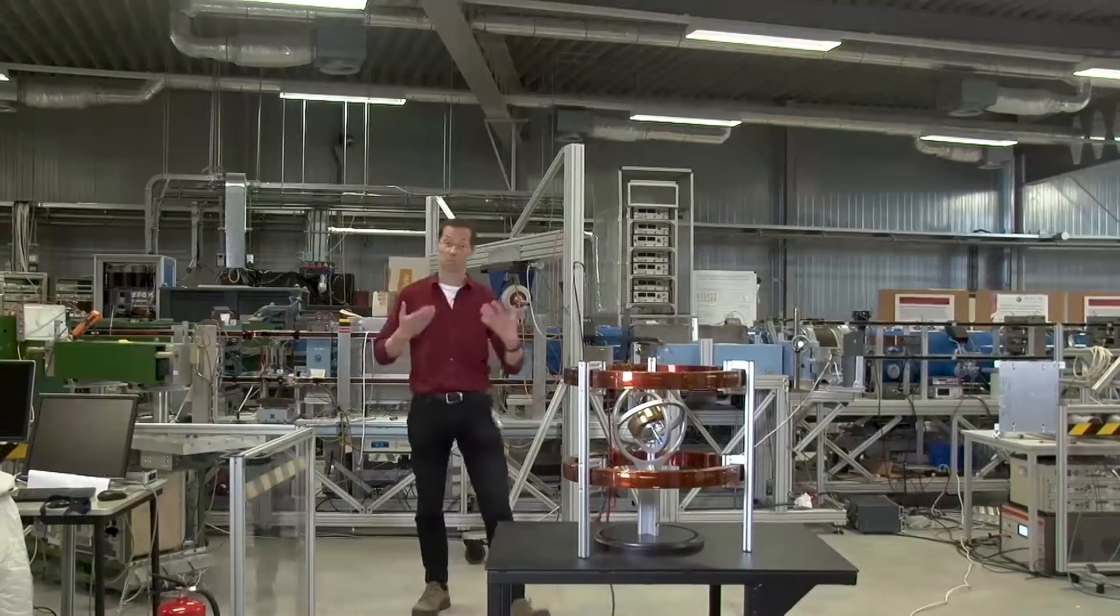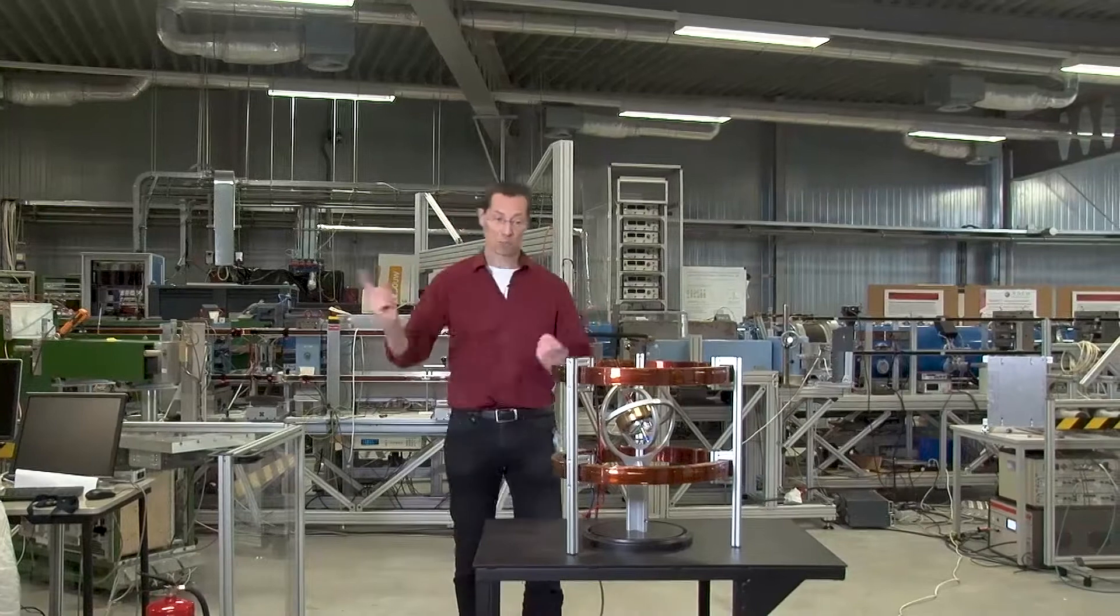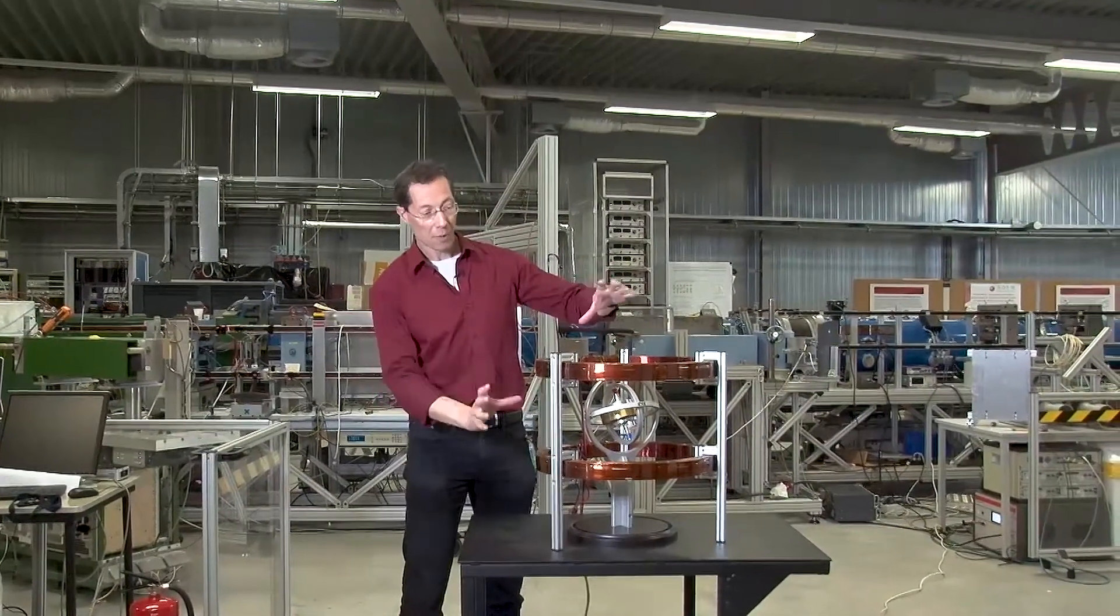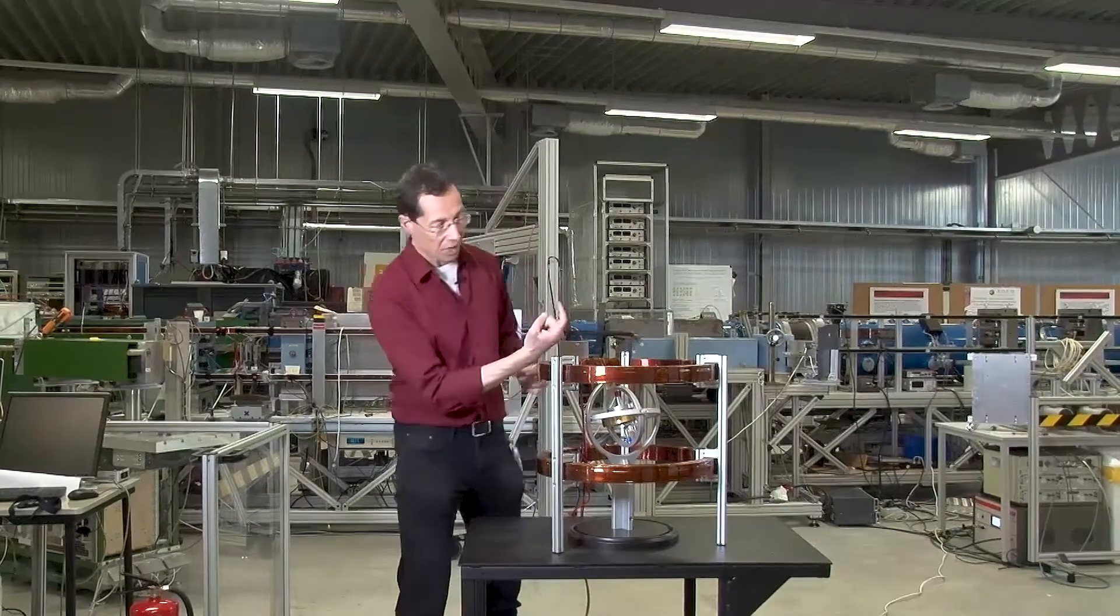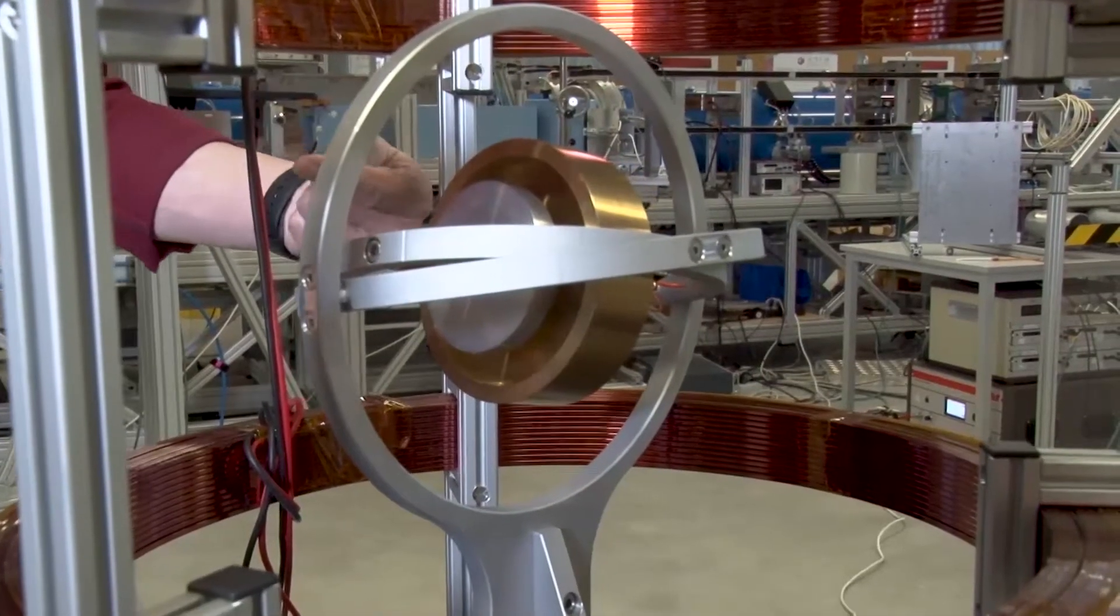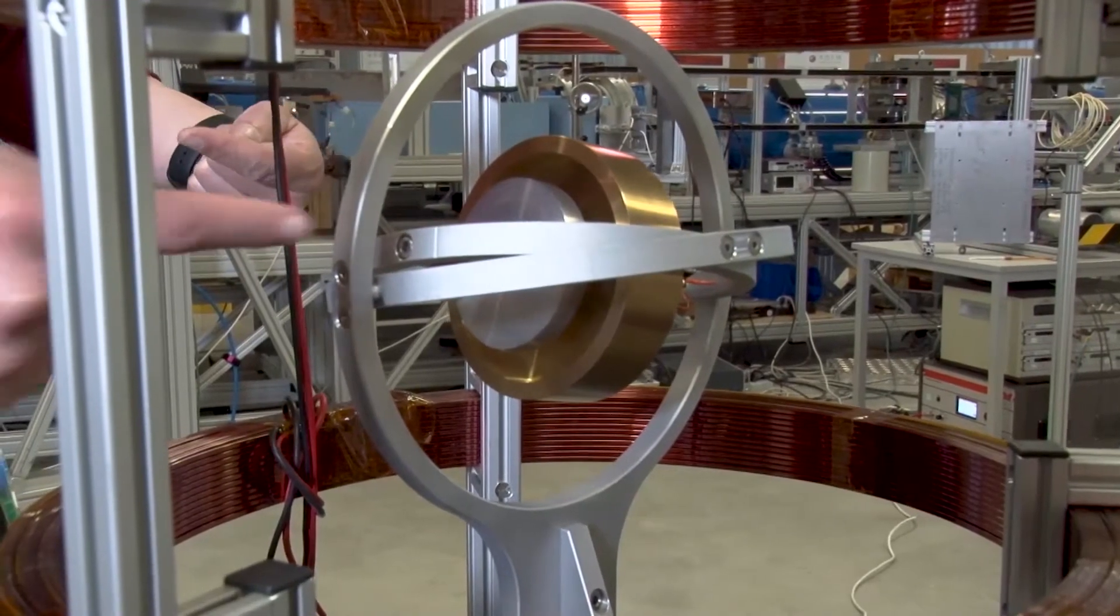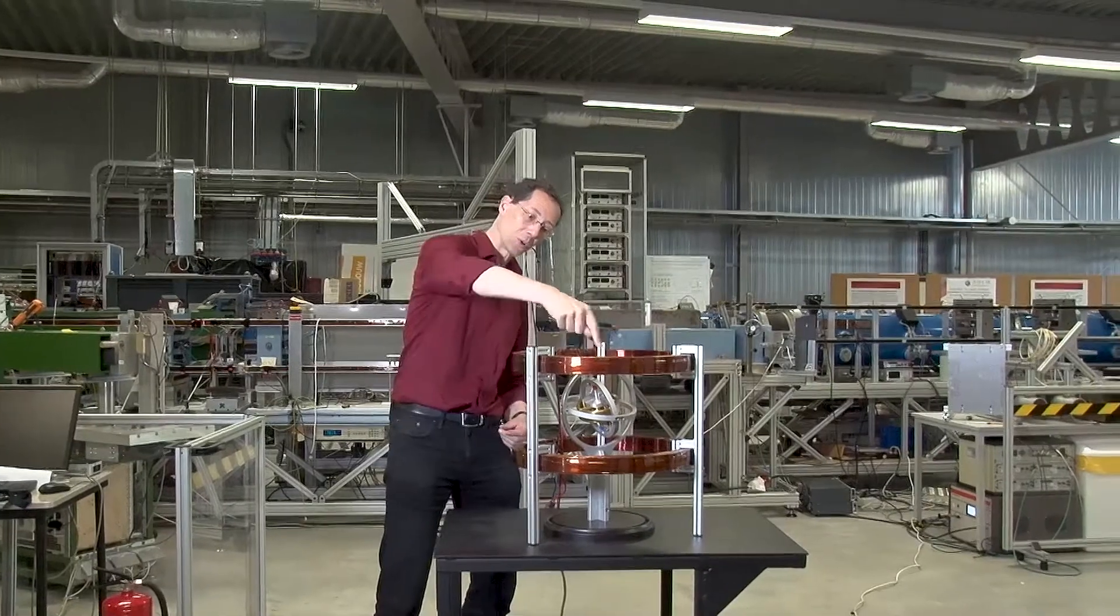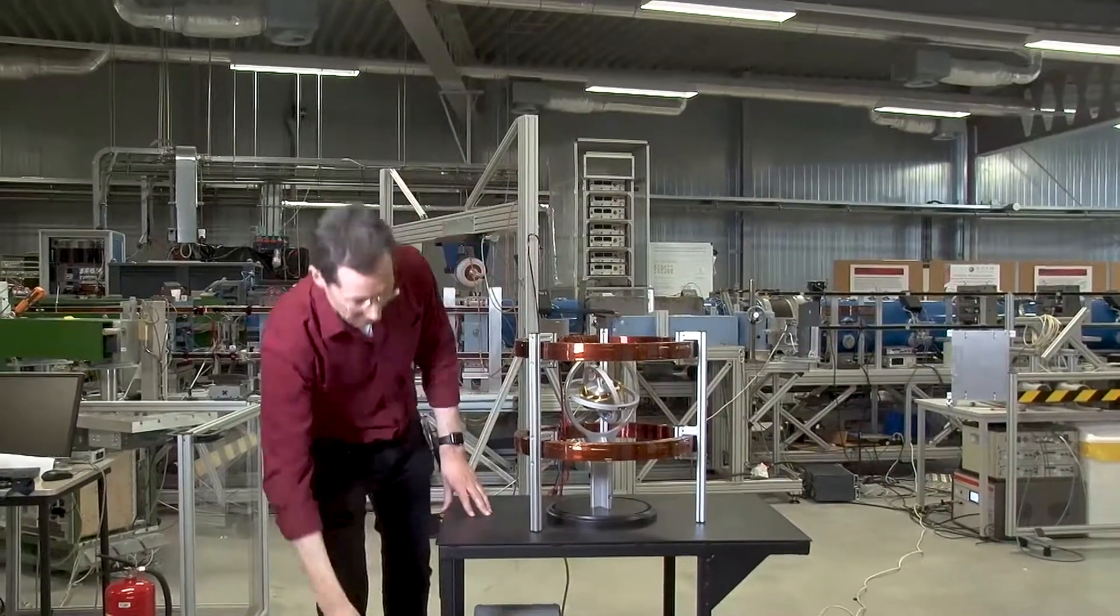In more detail, this idea of precession of neutrons in a magnetic field is something that we have here in a bigger model. Here you have a magnet on a rotating wheel, and this is representing the magnetic moment or the spin of the neutrons. It's rotating like this. And now we can switch on a magnetic field.